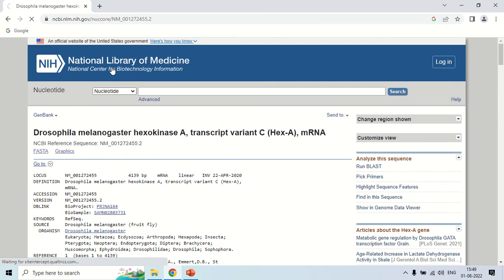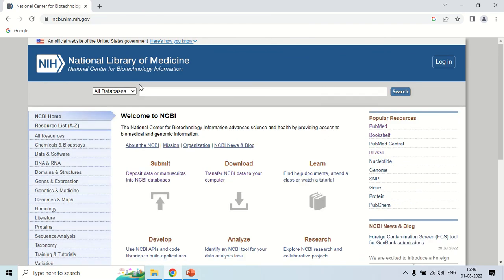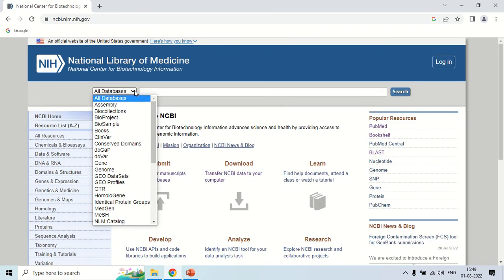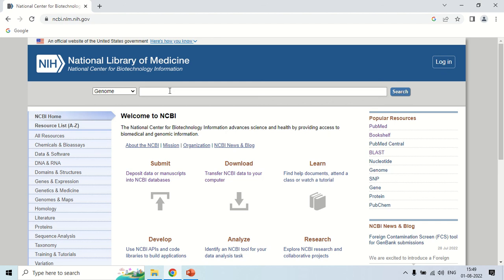Now again back to the home page. Another option which is important is genome. If you select genome and write the name of an organism, NCBI will give you the complete genome of that organism. It means in order to search for the genome, you have to select genome here.